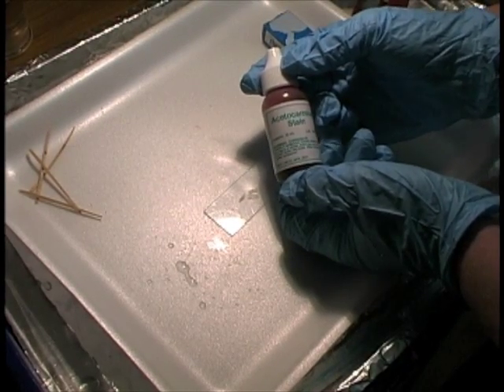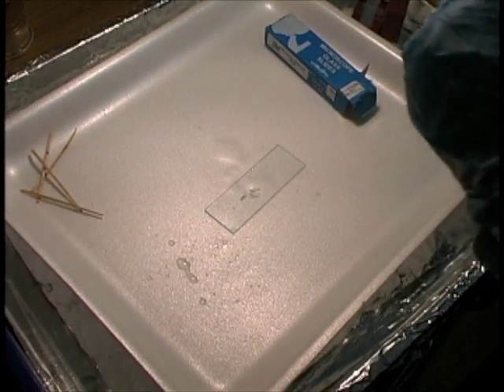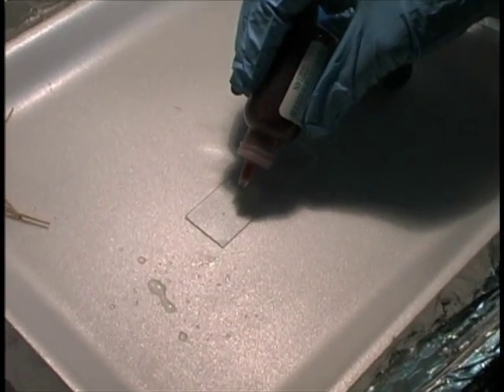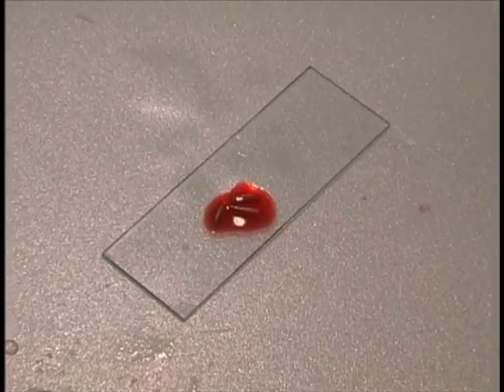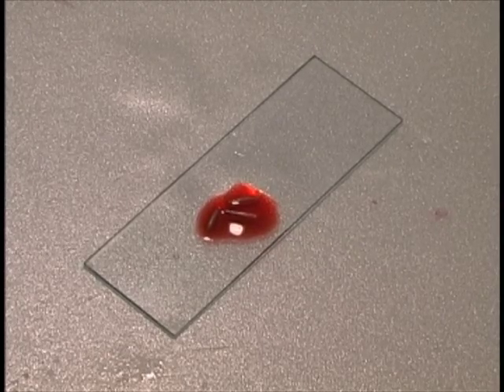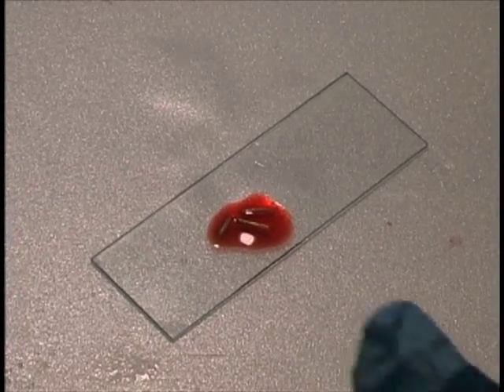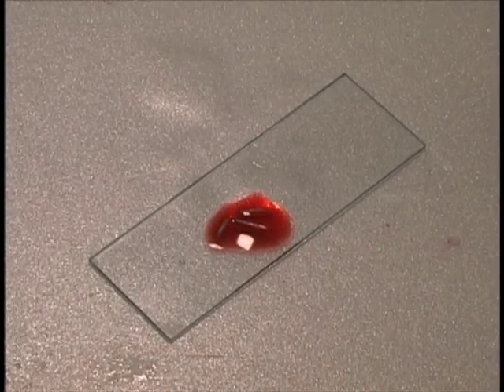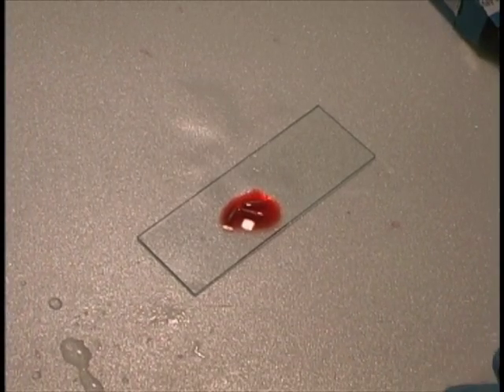Now I'm going to use some Acetocarmine stain — make sure you have your gloves on. I'm going to put two to three drops of Acetocarmine stain on my root tips and wait 15 minutes for the stain to be taken up by the roots. Notice I'm working on a tray so I don't get my work surface stained. This Acetocarmine will stain your hands, your work surface, and your clothing, so be very careful.